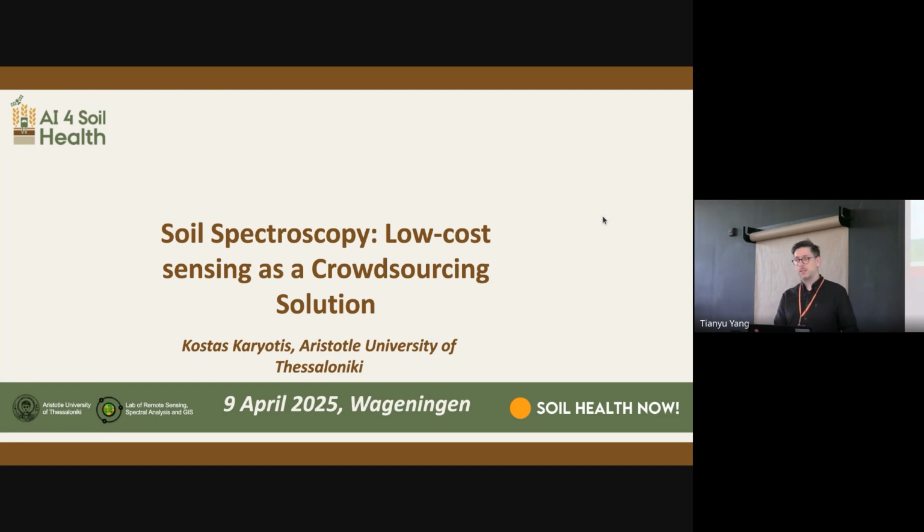I decided that this is the appropriate stage to take you a few years back, before AI for Soil Health, where we did a campaign and tried to see how we could use field spectroscopy to estimate soil properties.